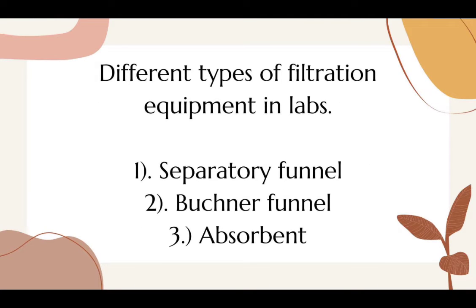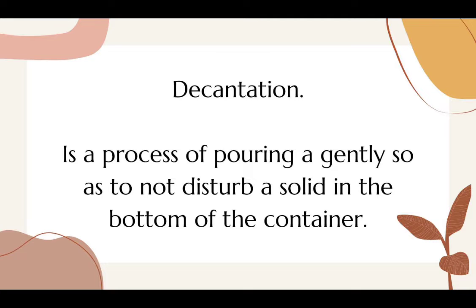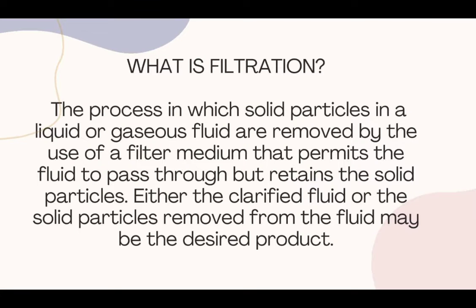The different types of filtration equipment in the lab. Number 1, separatory funnel. Number 2, Buchner funnel. And lastly, absorbent. Decantation is a process of pouring gently so as to not disturb the solid at the bottom of the container. What is filtration?